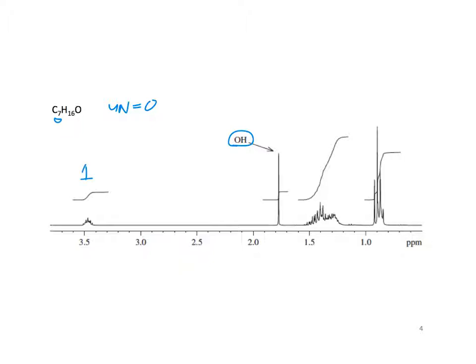So what does that tell us about the structure? Branched, and bonds to the OH. Well, or that the OH at least has to be what type of alcohol, what level of substitution? Secondary. It has to be a secondary alcohol, right? Because we know that there's only a single proton. Then this integrates for 1, which also integrates for 1 on the alcohol.